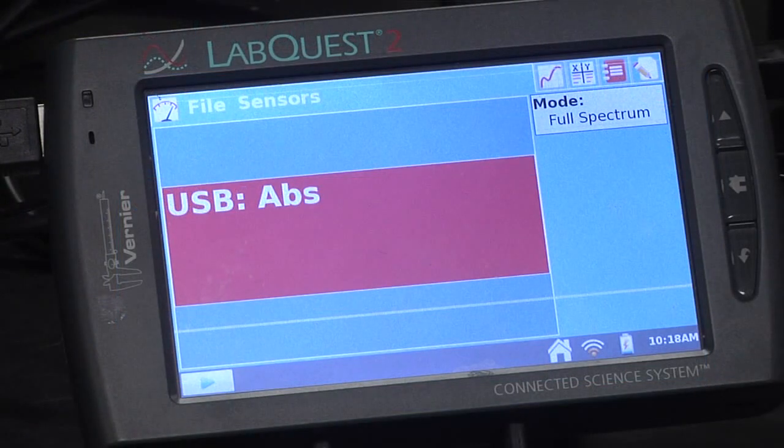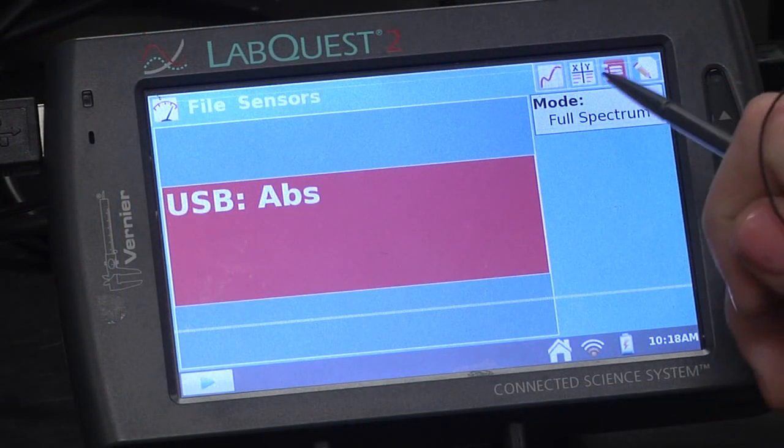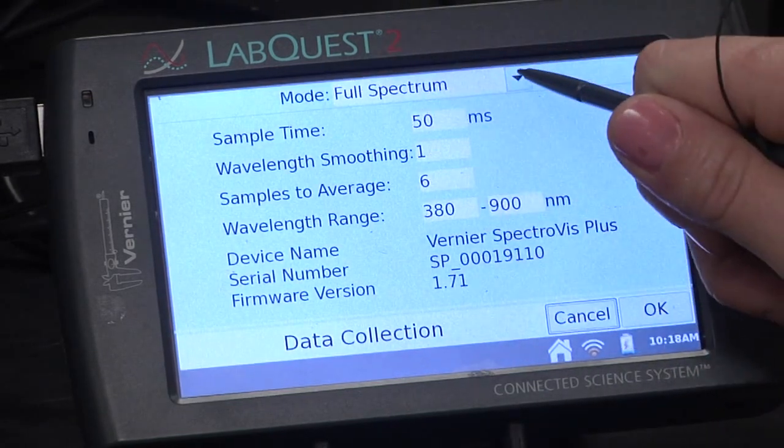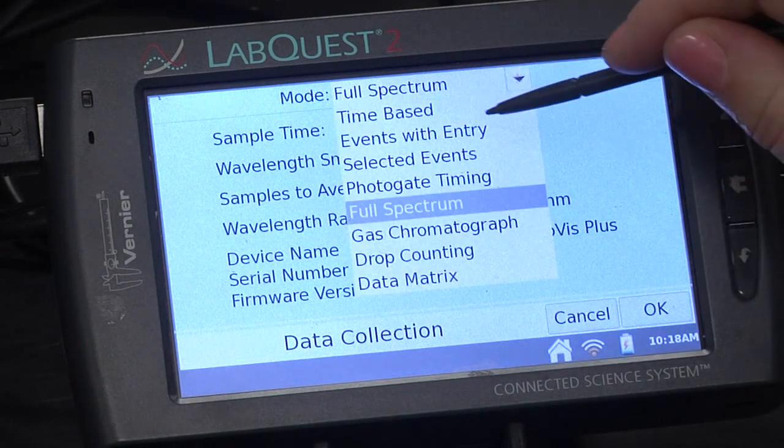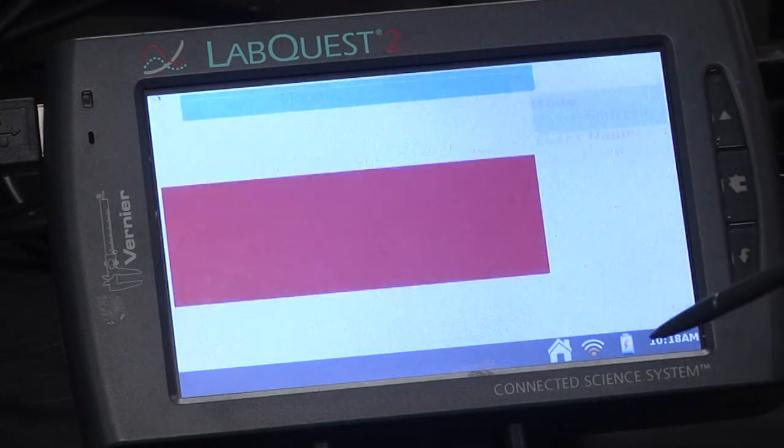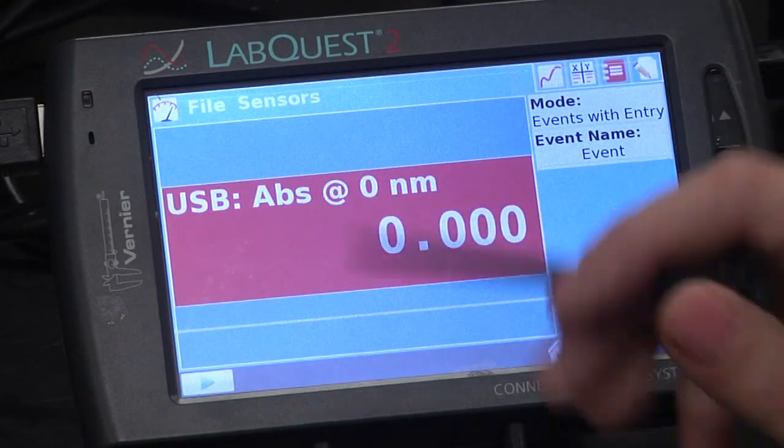The first thing you want to do before collecting any data is to change the mode. So this box right here, just tap it and change from full spectrum to events with entry.